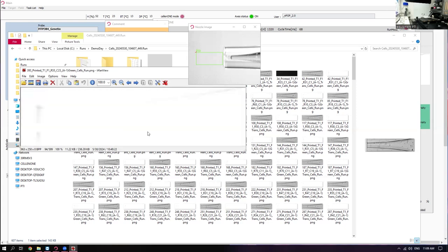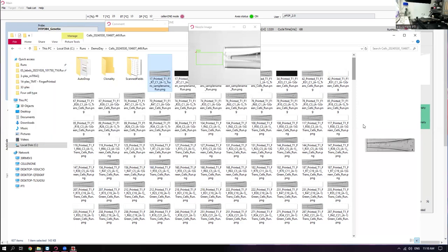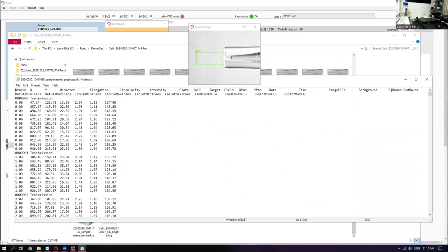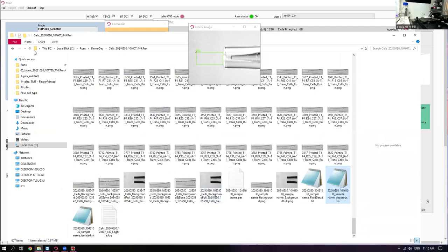Yeah, so you have this record. You can record all of the images with cells that were detected. There's a number of different files here that can output data. Let's see. These are all the isolated cells. This is just the global properties of all the cells that were detected. So there are a lot of ways to analyze this data.